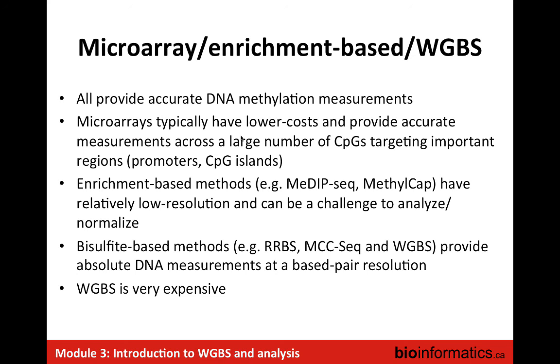Yes. Right. So as I said, we focus here on just one type of DNA methylation, which is cytosine methylation. There are other types of methylation. One of the advantages of whole genome bisulfite sequencing, for instance, is that it's not restricted to detecting that mark only on the CpGs, so you're able to detect other C-methylation outside of that context.